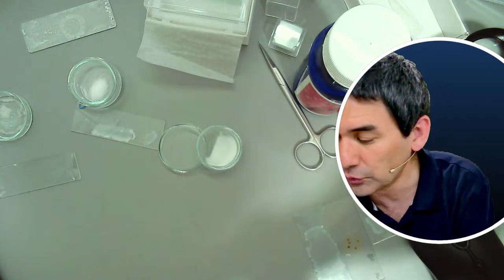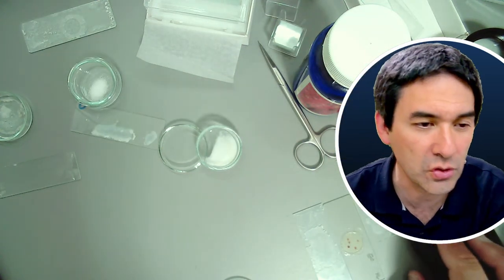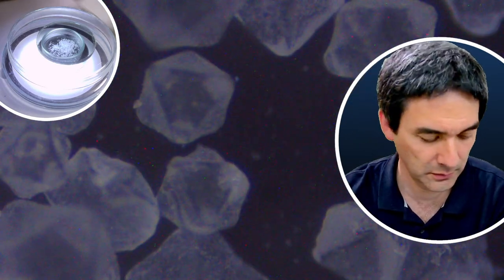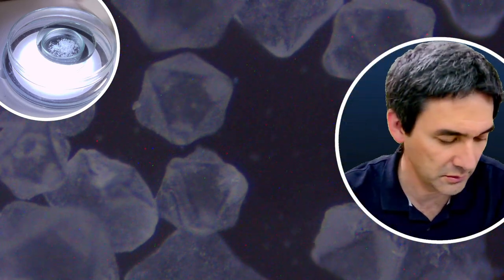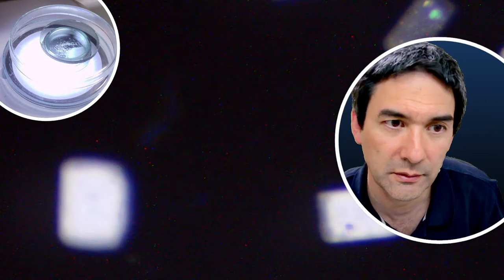And we're just going to look at it directly under the microscope like this, let me have a look. And then I'm going to try to grow them on a slide, just like I did with the vitamin C. And here we go. See, again I have to focus. Yeah, and this is how... No, this is the wrong one. This is the salt, I just realized. Always label your jars. This is the salt here. This here is much finer. This here is the aspirin.